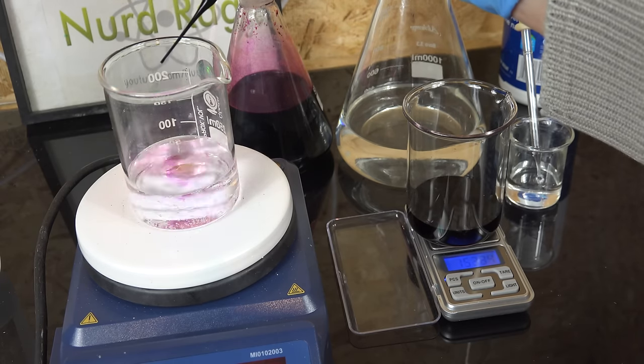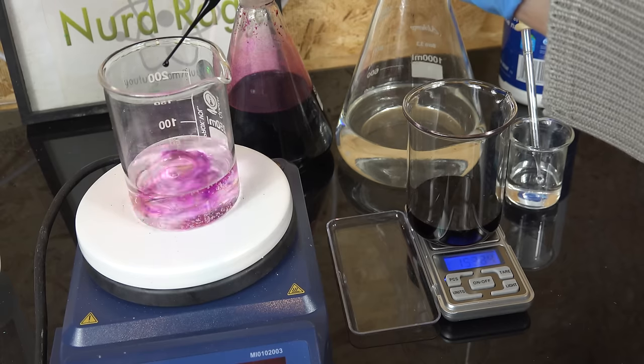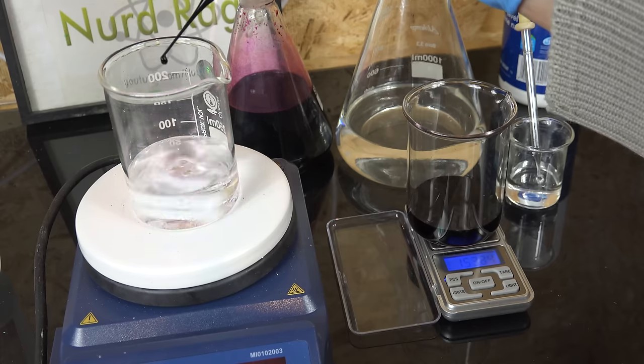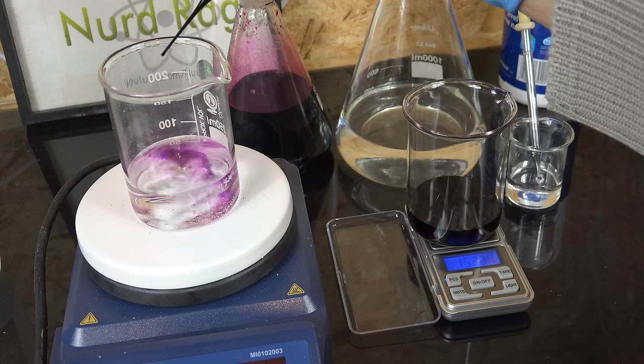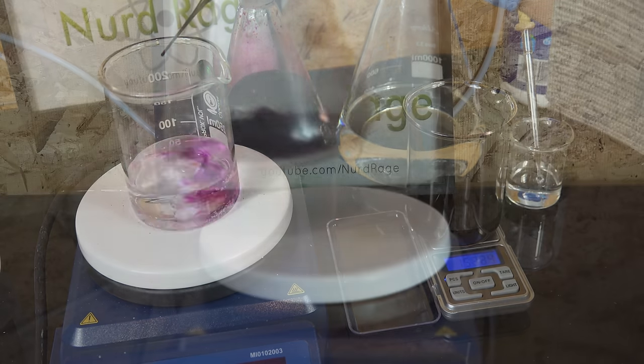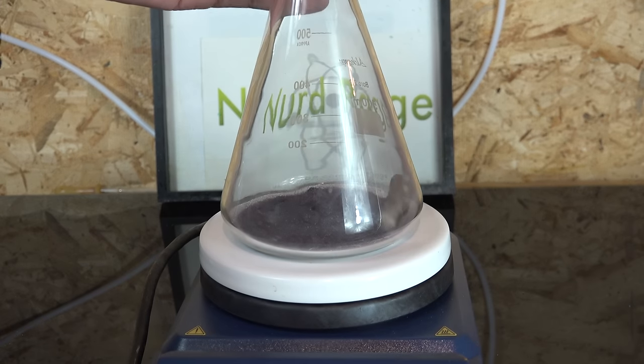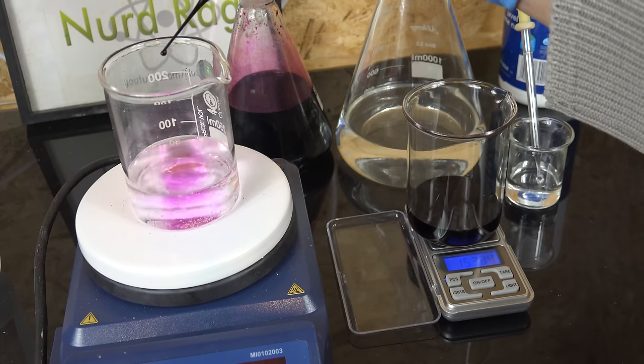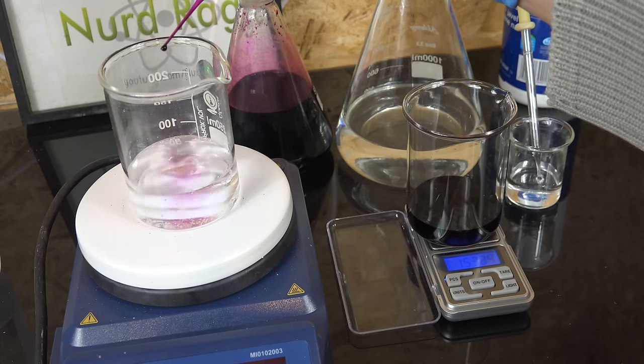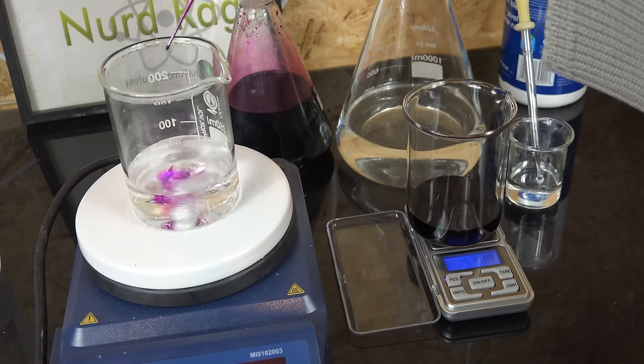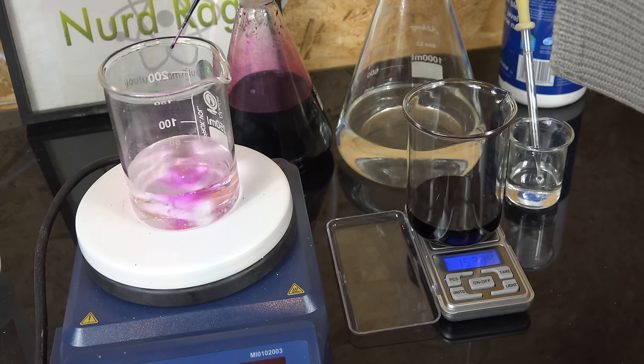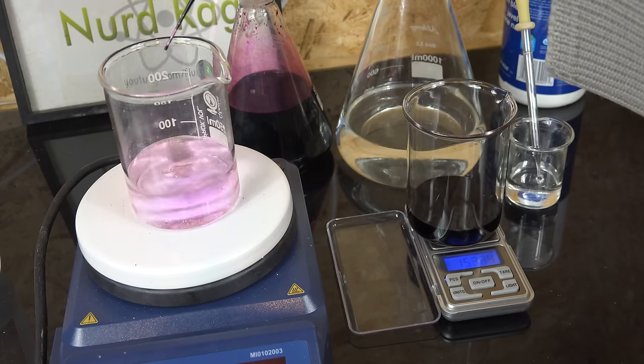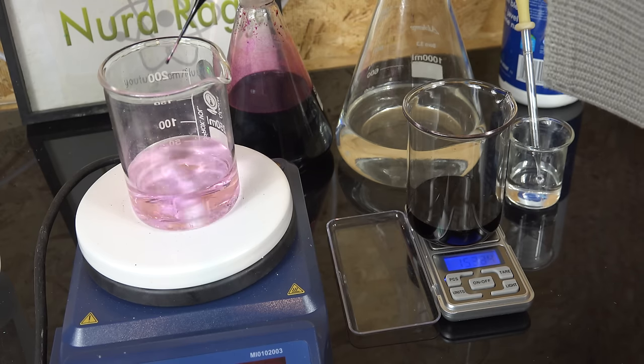Alternatively we can use electronic means like pH electrodes or oxidation reduction potential electrodes. For hydrogen peroxide we're going to use a very convenient titrant that's also an indicator: potassium permanganate. Under acidic conditions potassium permanganate reacts very cleanly and completely with hydrogen peroxide. And being strongly colored, after it reacts it will linger and indicate to us that the reaction is complete.